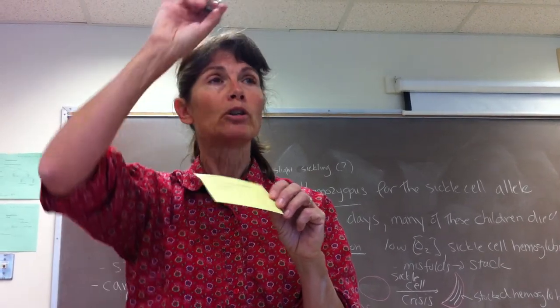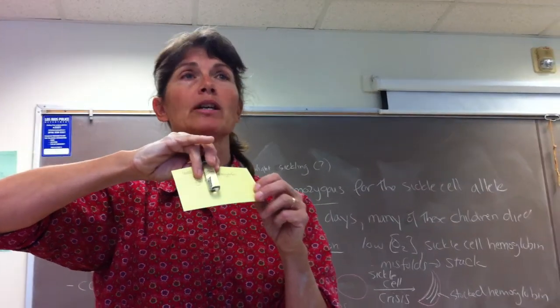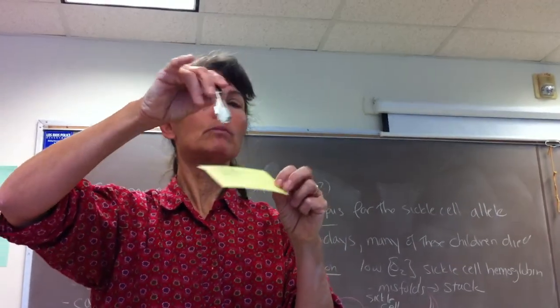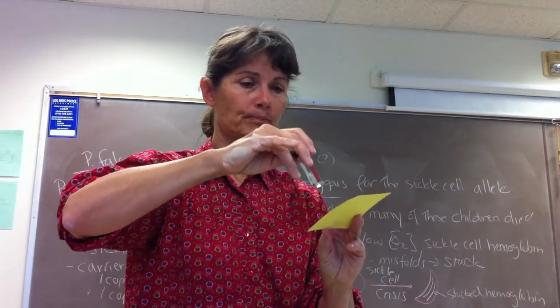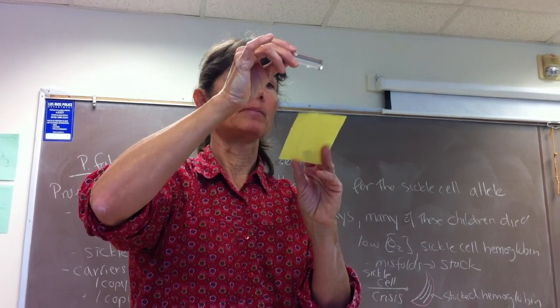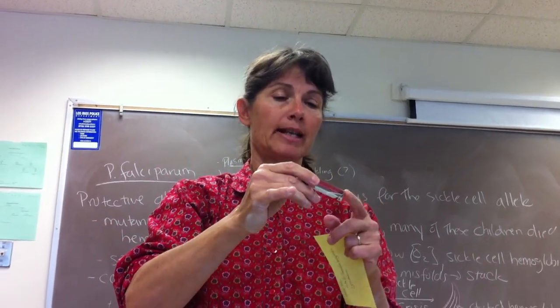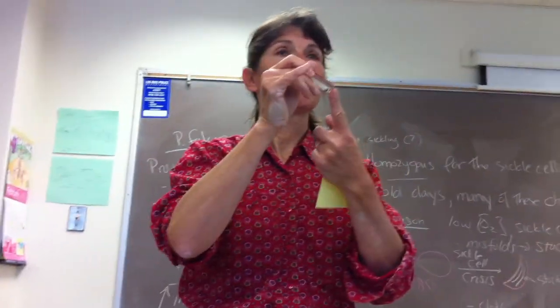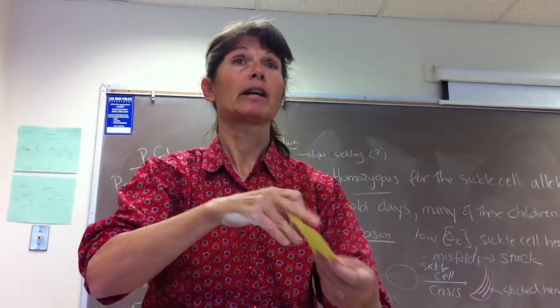But rodents are the most important reservoir of Borrelia burgdorferi here in California. Back east, deer are more important. Here, it's more of a rodent problem. Okay, so we'll set up a dissecting scope with the Ixodes ticks just so you can see them. And on the lab exam, you guys, I wouldn't ever ask you to identify Ixodes versus Dermacentor, but I would want you to recognize that they're ticks, and that ticks are the vectors for Lyme disease here in California.